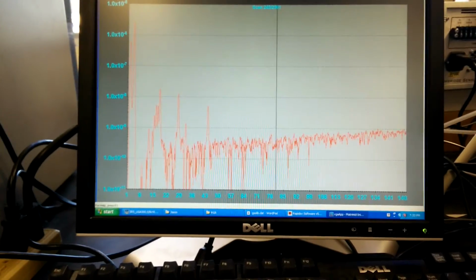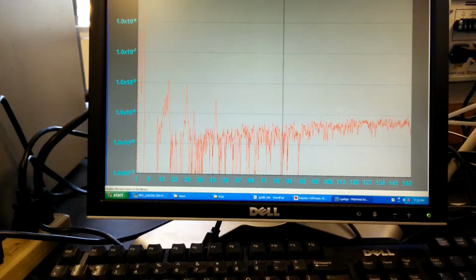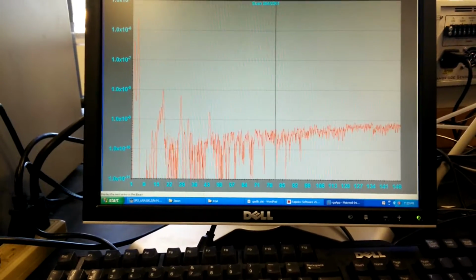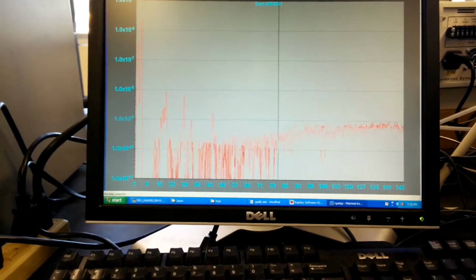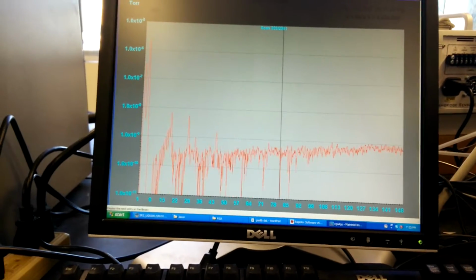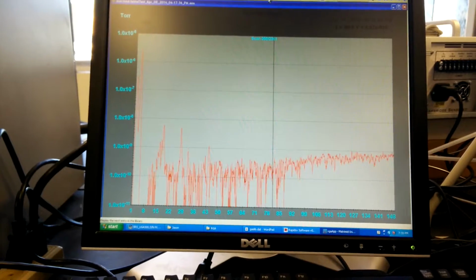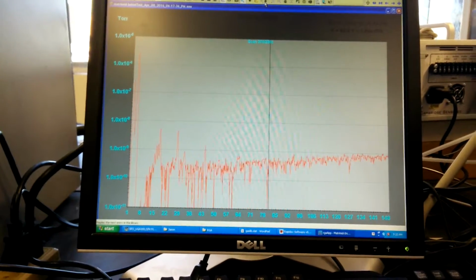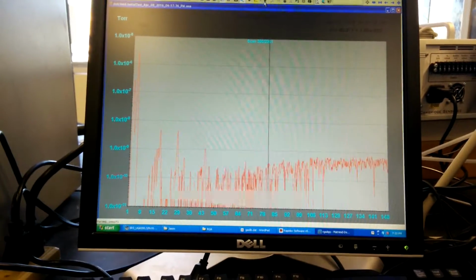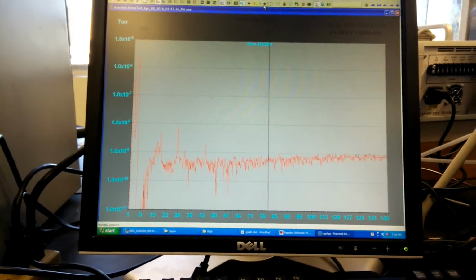So the reaction is continuing, just soaking, and so the peaks are starting to decrease slightly over time. Water tends to become more prevalent later in this reaction, interestingly. So everything is just settling down during the soak time. After 2 hours, most of the reaction has taken place.